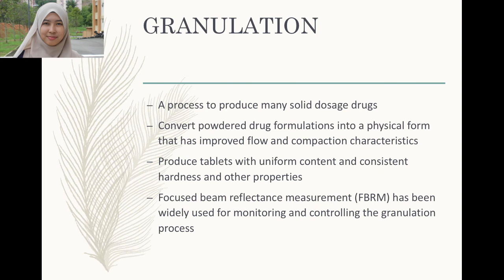During granulation, powdered particles adhere to one another to form agglomerates and the size of the particles is increased. Focus beam reflectance measurement (FBRM) has been widely used for monitoring and controlling the granulation process. An at-line FBRM technique is used to monitor the granule growth and also used in line to follow particle size enlargement during high shear wet granulation.